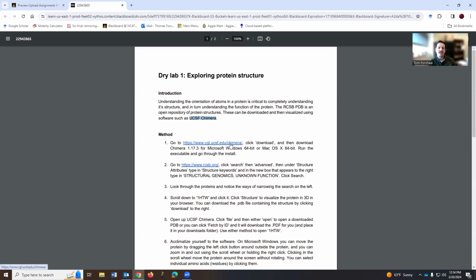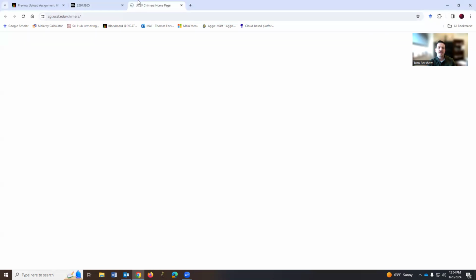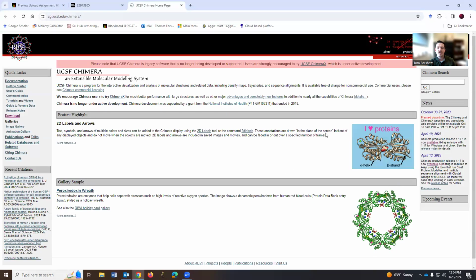And if we just click to go to the website, you can bring it up here. This is the Chimera website, and you'll need to download the program. And actually, by sheer coincidence, protein of the day is actually the protein I studied in my postdoc for years, this peroxiredoxin here. But this is the website, and we do not want Chimera X. We want to use original Chimera.